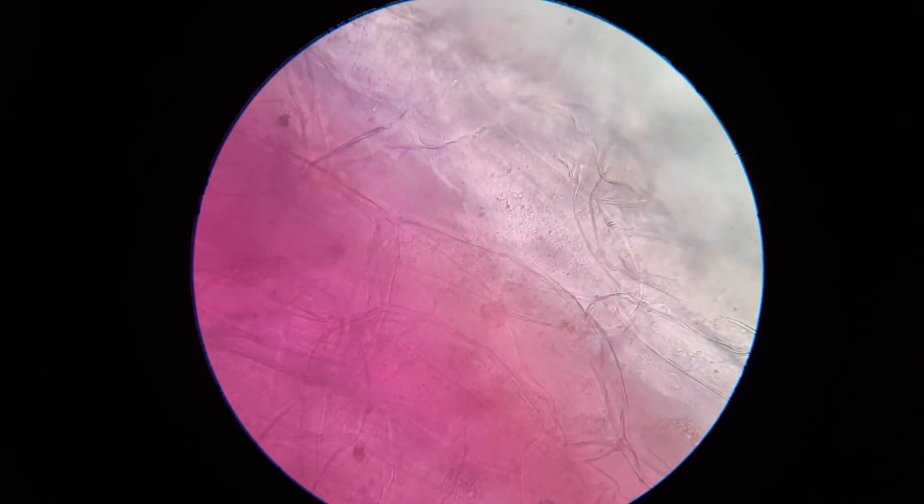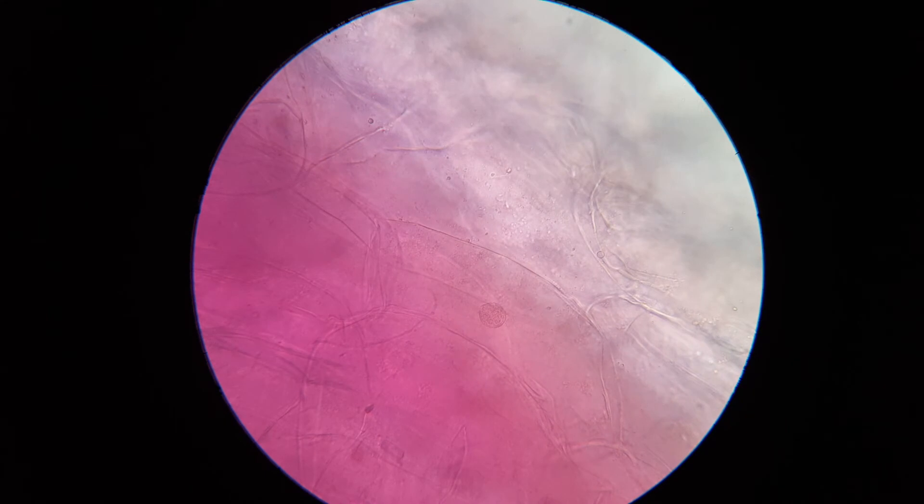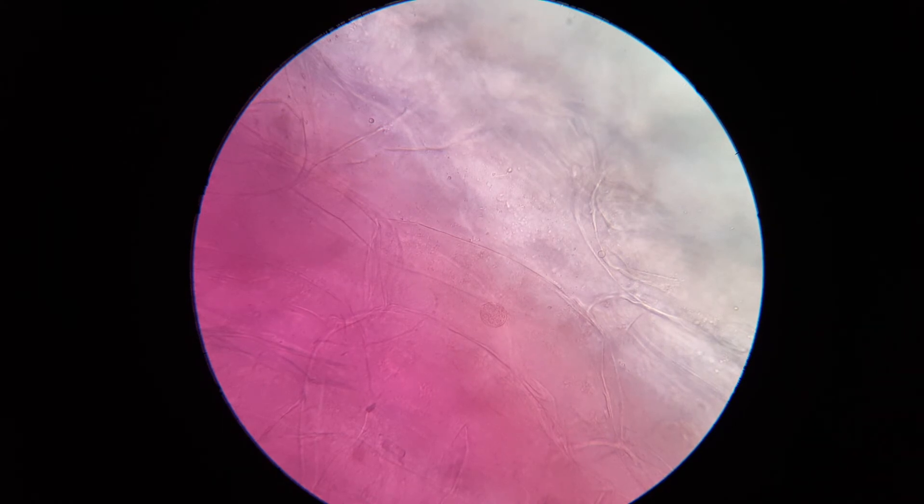You're not seeing organelles that contain the purple color, however. That contrasts with what we see with, for example, the red pepper. So I'm now going to — that's under the 40x objective — switch over to the 100x objective.